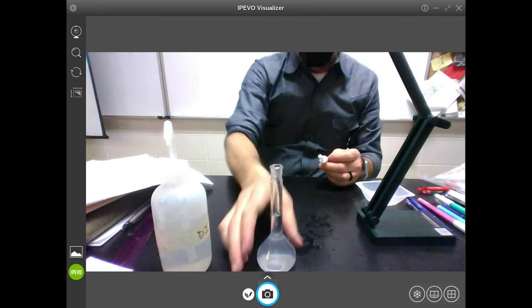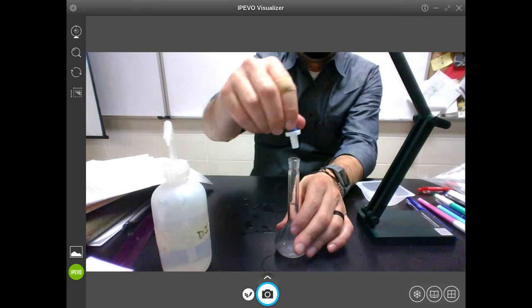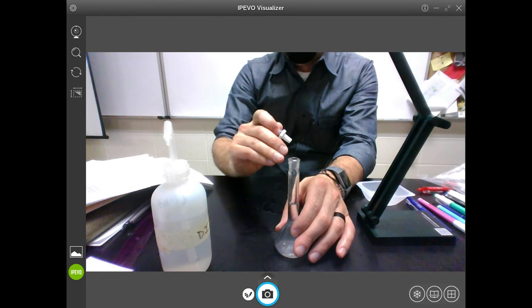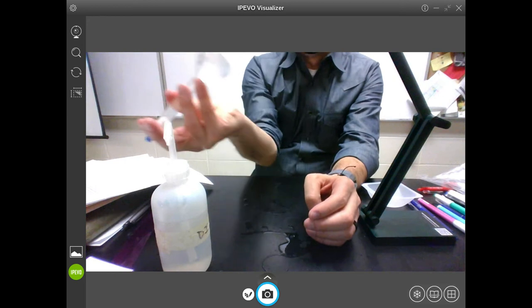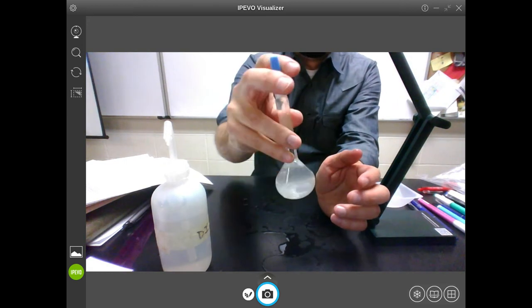Okay, don't blow by. I blew by the line, but it doesn't really matter because I'm just showing you what to do. Don't blow by the line. Be very careful. You can always add more till you get to the line. You can never take away. So once you get it to that line, you mix it up real well.